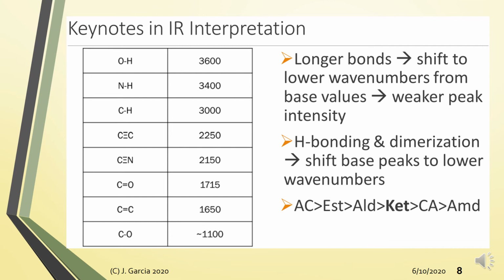So you have OH and NH, NH can be found in amines and amides. Both OH and NH usually exhibit broad peaks. In the case of amines or amides, for primary amines, you will have a broad peak with 2 sharp spikes, but for secondary amines or amides, it's a broad peak with 1 sharp spike.